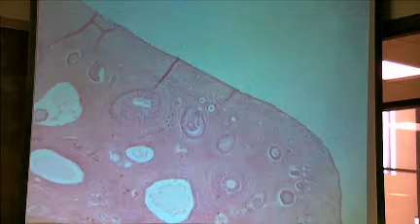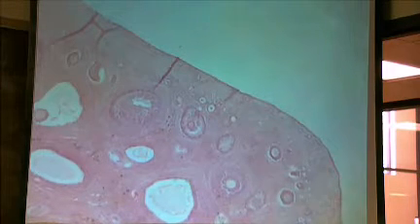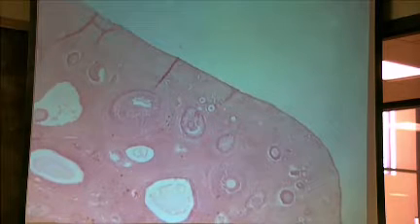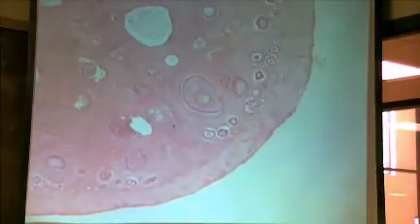So the ovary slide begins on page 89. Now, I'm just going to tell you one thing. You may not find all the structures you're looking for on a particular slide. Just have that in mind when you pick up one of these slides. Now, this is what it looks like under low power here. We're just going to look around this for a second.